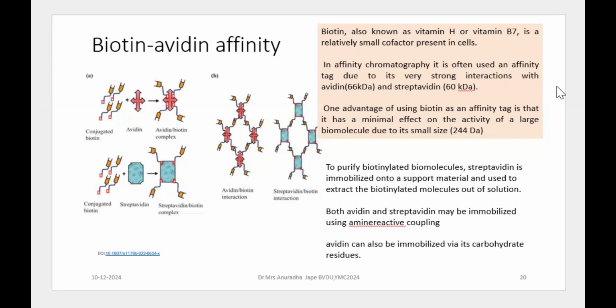Now, biotin and avidin, these are interacting with biological specificity. So, if you see in the schematic representation for it, you will see in the first the biotin molecule, right? So, biotin molecule is attached to the antibody, so it is said to be conjugated, right?